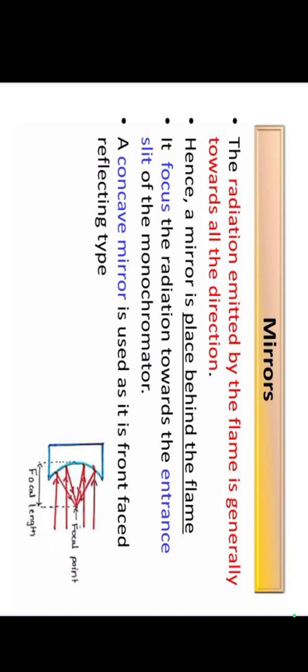Household mirrors are not used in flame photometry because they are made of support material such as glass or quartz. So household mirrors are not used in flame photometry.